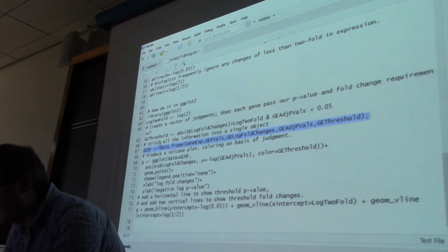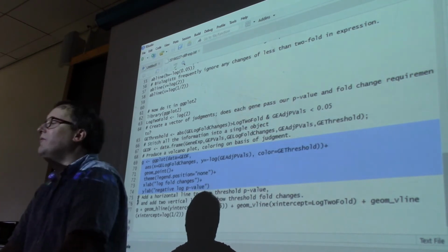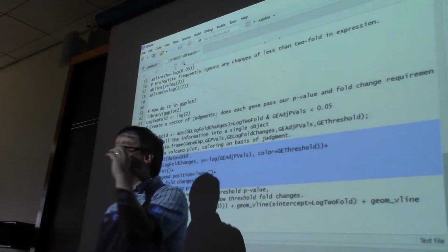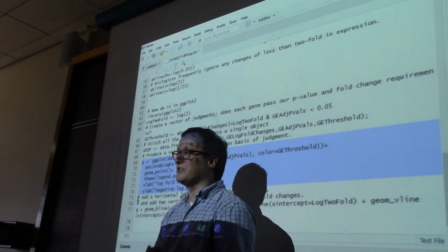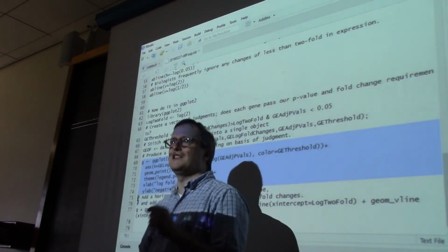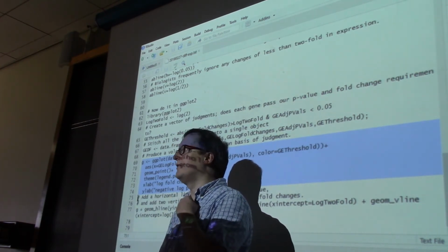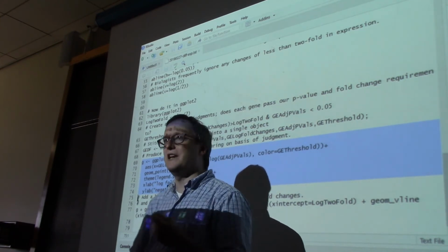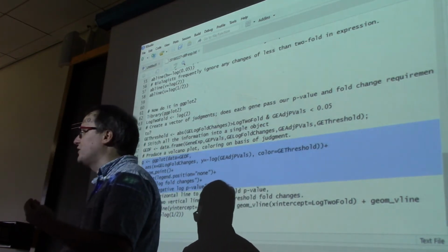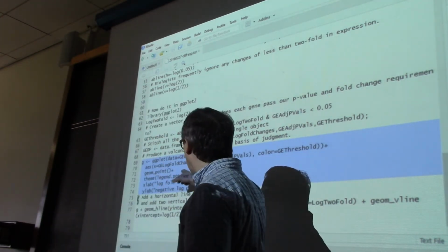So having created that data frame, we can now produce a volcano plot. I want to say that the ggplot2 library takes a little getting used to. I would say I'm still very early in my learning curve on this one. So why is it called ggplot? Is it written by Gus Grisham or something? It's not. It's written around an idea that was published, I believe, in the 1990s, called the grammar of graphics. The idea being that there are several features of data visualization that apply across all kinds of different plots. And in this case, we are using several of these.